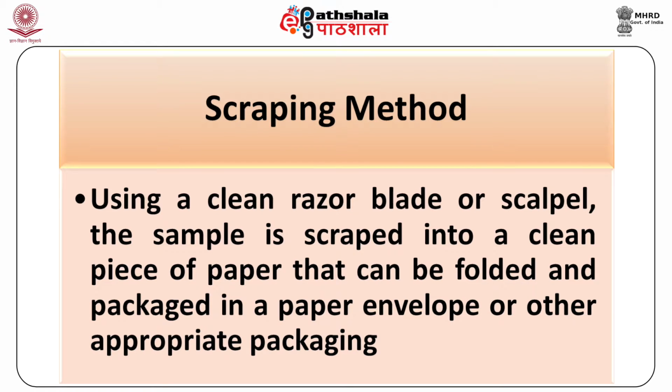Scraping is another method where, using a clean razor blade or a scalpel, the sample is scraped into a clean piece of paper that can be folded and packaged in a paper envelope or other appropriate packaging.